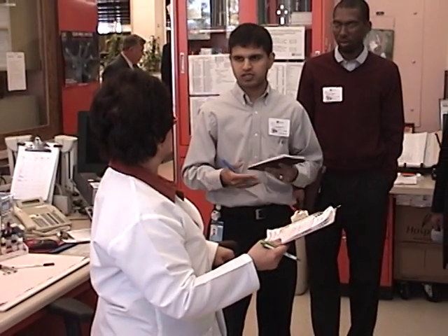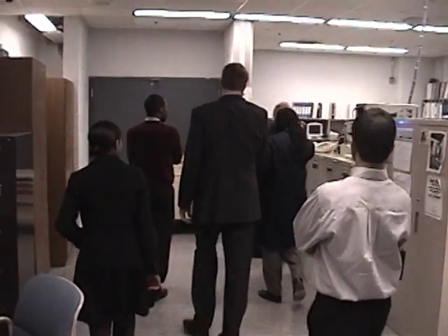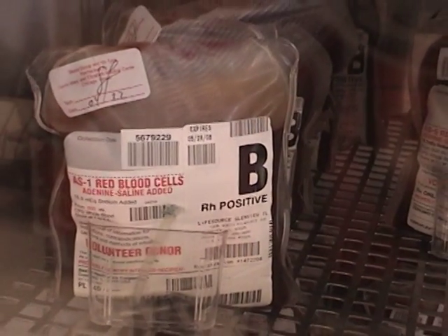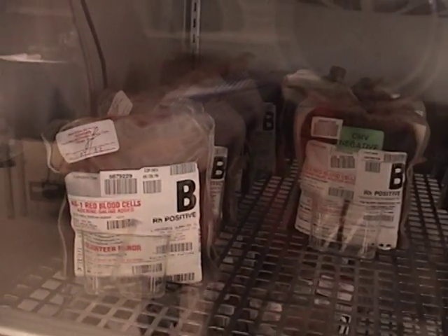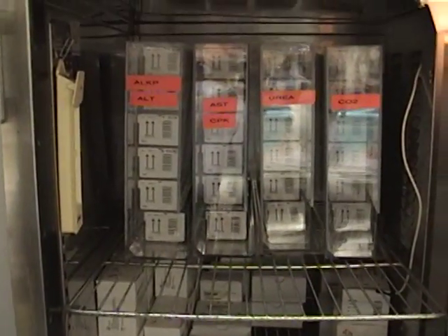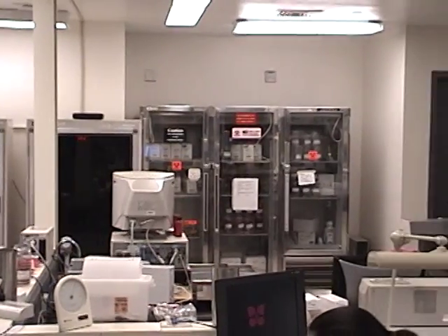Our team talked to a variety of individuals, from lab supervisors to medical technologists, trying to understand and see some of the issues around environmental monitoring. As expected, we found that storage of blood, reagents, tissues, medications, and food all need to be monitored events, and records of the compliant processes must be retained for inspection and audits.